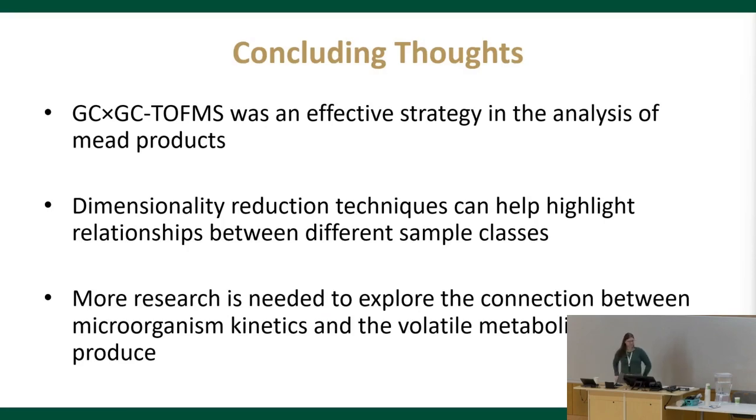In conclusion, GC×GC-TOFMS was a very effective strategy for the analysis of mead products and aroma profiles. We were able to use dimensionality reduction techniques to help highlight the differences in relationships between sample classes. And we're hoping to put more research into how the environment of microorganisms like yeast impacts their volatile organic compound production and how that would impact the final aroma profile or taste of the mead products. In the future, we're also hoping to connect the microbial kinetics data that Silverhand Meadery collected while they were brewing this mead to the volatile profiles we've developed here.